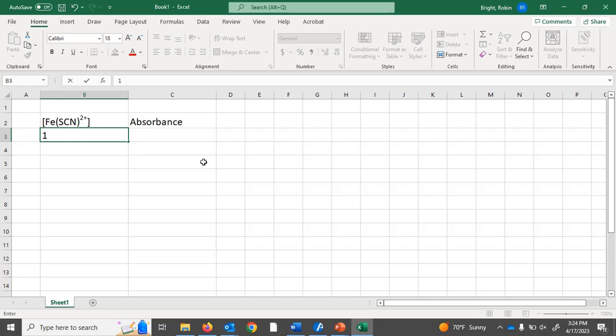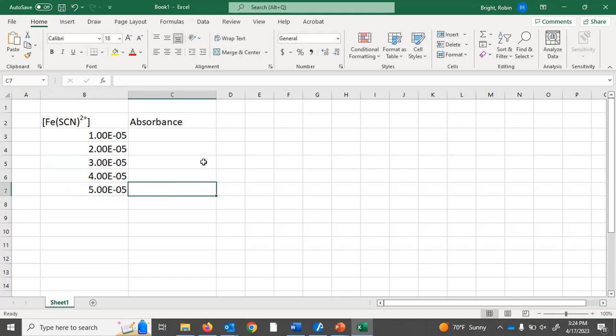So I'm going to make up numbers. If I want to use scientific notation in Excel, I basically do it the same way I do it on iClicker: one capital E minus five, two E minus five, three E minus five, four E minus five, and five E minus five. And like I said, I'm just going to be making up numbers: 0.02, 0.04, 0.058, 0.084, and 0.095.